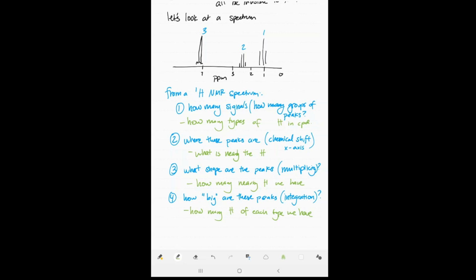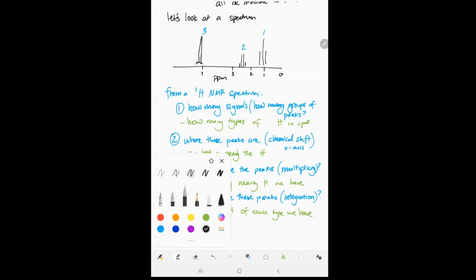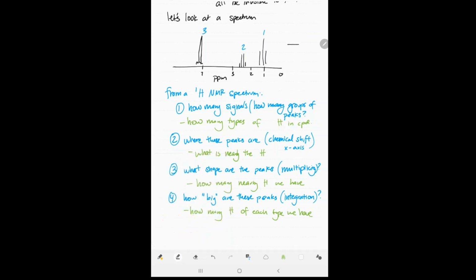All right? So this is ethylbenzene, by the way. The structure that we kind of showed. So it's just ethylbenzene. That molecule gives this particular spectrum. And don't worry, I'm not going to be hand drawing anything for you on your exams. I'll be using actual spectra, or rather predicted spectra. So we'll see.